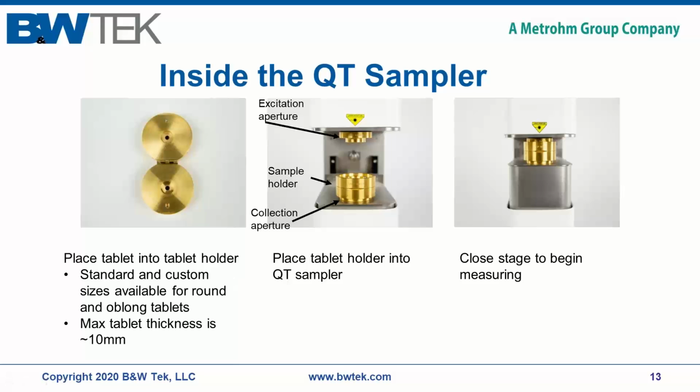Is there any comparison of the performance of the transmission Raman mode and the normal Raman regarding this application? There have been publications in the past on that. Actually, in the past 20 years, there are probably numerous publications in the open scientific literature that one could look at for that.